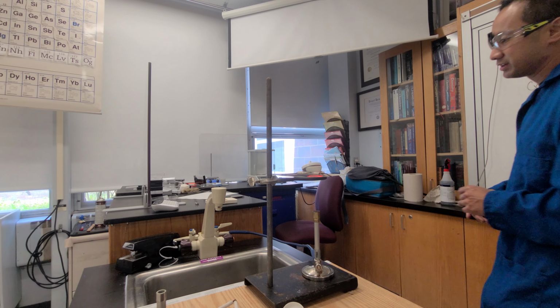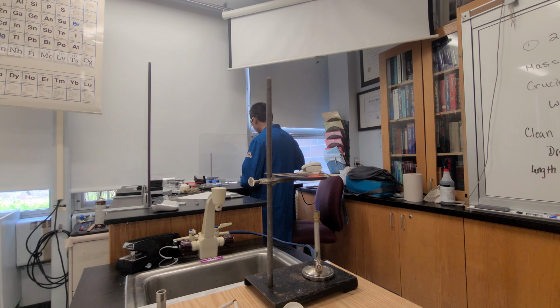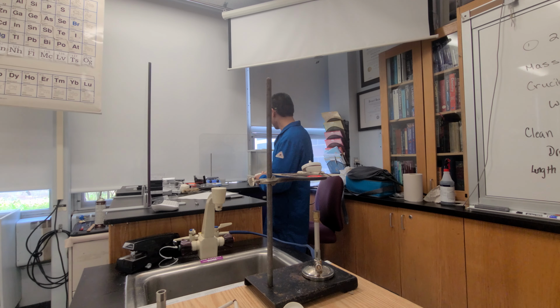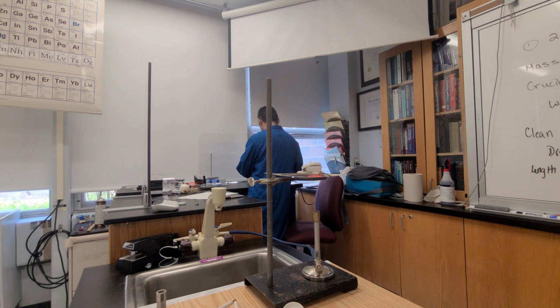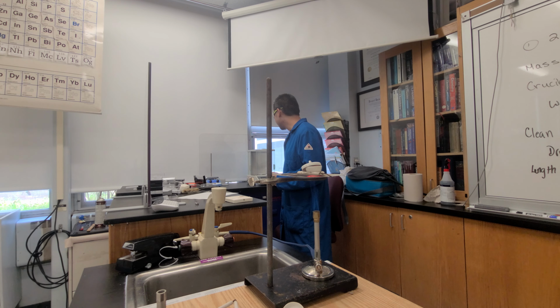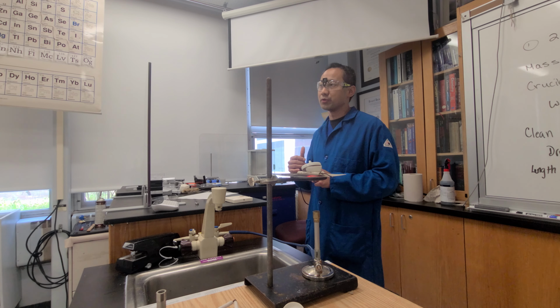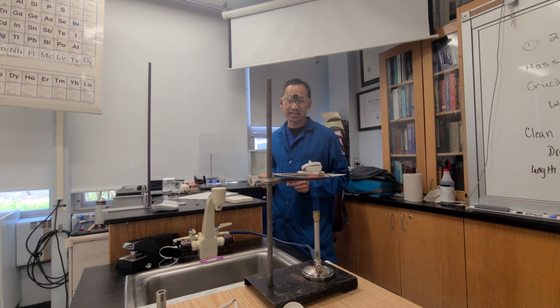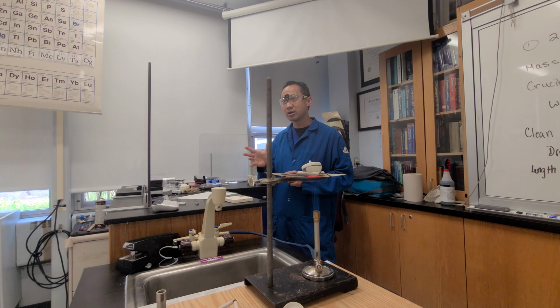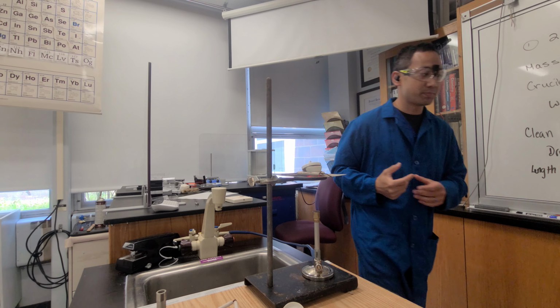So one of the reasons why I really do like this guy right here is because I can actually use this on here, and it will deflect enough of the heat. The biggest issue though is that on an analytical scale, it's going to overload the analytical scale. So what I have to do is actually go to a standard 0.1 gram scale, and that's what I do. So I use a 500 gram scale, and I'm going to bring one of those up here.